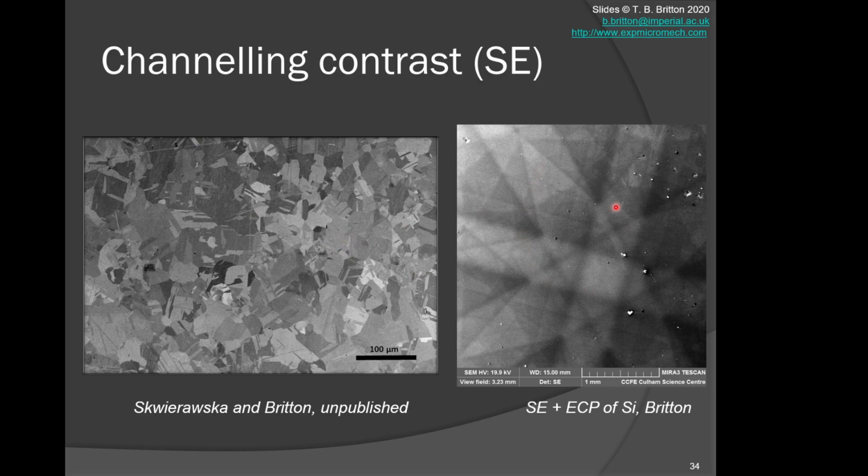If you're looking at a single crystal, this is an example that I grabbed off a large single crystal silicon wafer sample. Because I'm looking across multiple millimeters, that changes effectively the incoming angle quite significantly. In fact, I'm looking at a wafer slice that has an 001 axis pointing out of the page. That is the center of the 001 axis. And these are effectively looking at different crystal planes. This is a 110 type plane, and this is a 110 type plane, and then associated other planes, etc., that go through those zone axes in here. These are specks of dust, fiducial markers, as we like to call them in our systems.